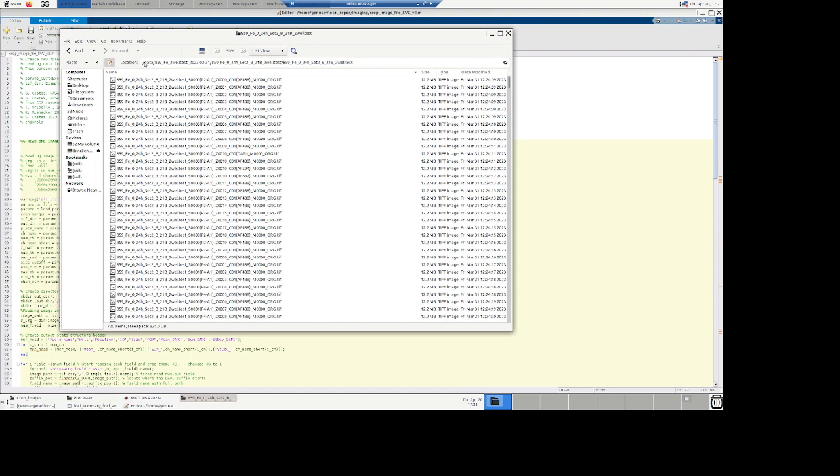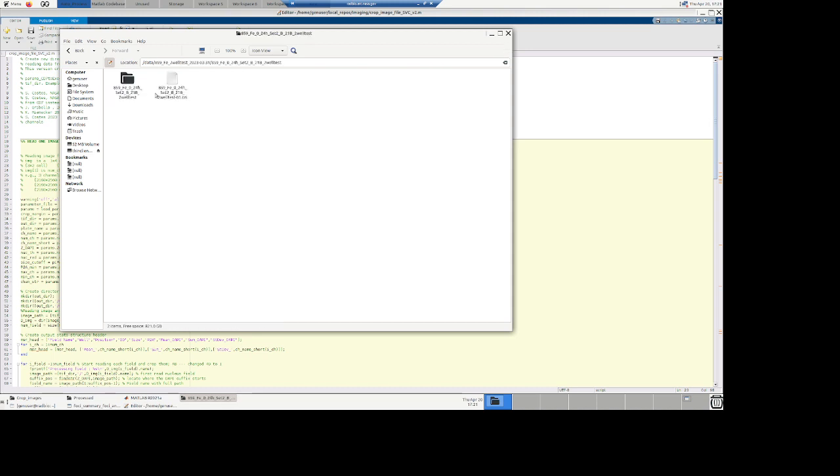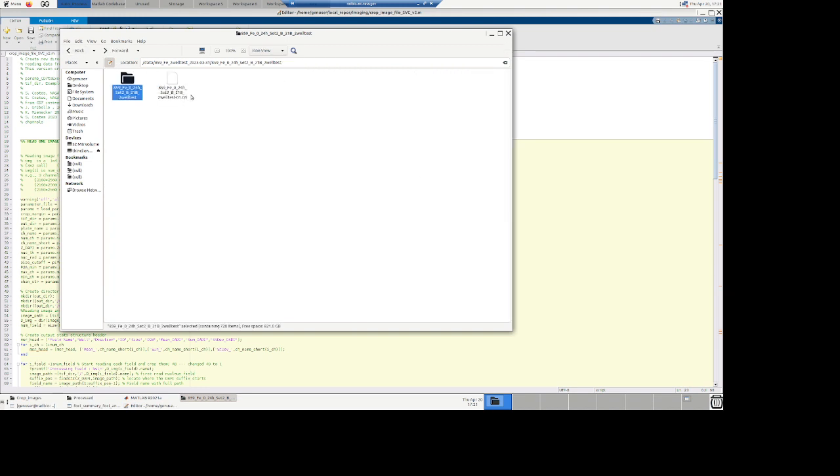Now, I'm under /data, and there are different wells. I'm going to use that well test. Here it's interesting what you see. That .czi, all these images are embedded into that one file when you take the image on a Zeiss microscope. And you can see the size of this is pretty big. It's almost 1 terabyte. It's 800, sorry, it's 8 gigabytes. I was like, that's huge.